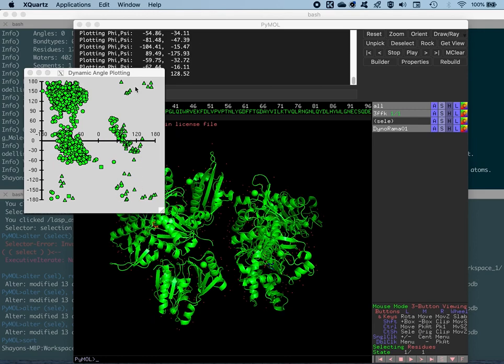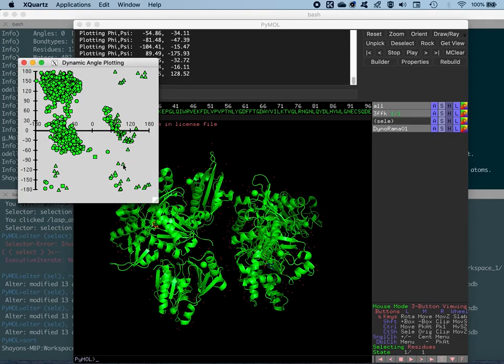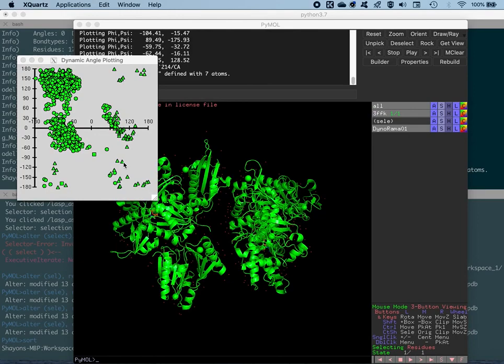Now let's have a quick look at the different positions that they might occupy. So let's pick one glycine residue from here. Let's say this one. Now, this is going to be a bit tricky, and you have to be very careful while picking this particular glycine residue, because when you click the left mouse button on top of this, it will try to change the phi and the psi angles according to your needs, even if you don't drag and just click on it. So never do that unless you absolutely have to.